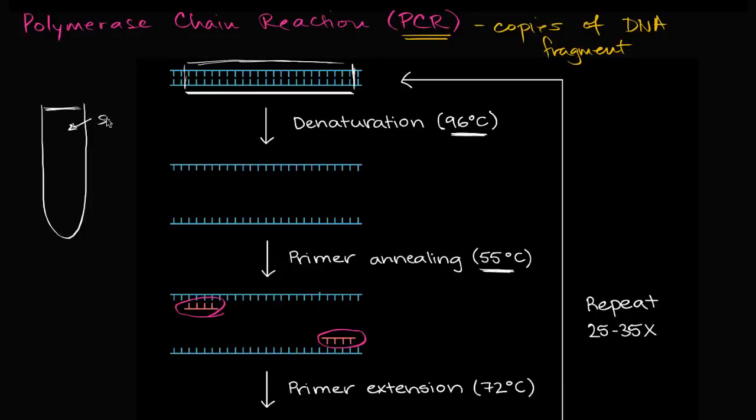Okay, so we have our solution right over here. You'd put whatever your initial DNA sample is in there, and once again, it's a very small amount. You'd put a lot of that primer, in a lot of surplus. So let me do that in this magenta color. You obviously wouldn't see it in real life. It would just all dissolve. It would just look like a drop of liquid. But for visualization, you put a lot of primer, and you heat it up, the DNA strands separate, and then when you cool it back down, this primer is going to be specific to the ends of the region that you want to copy.